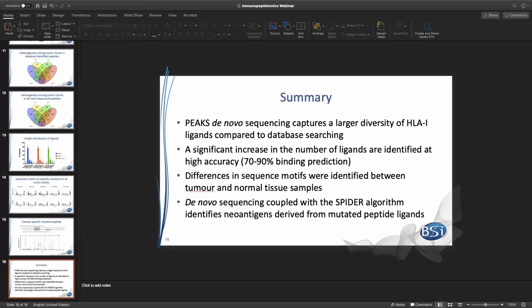And missing values are one of the major known issues for DDA, right? That's why even our lab is using DIA a lot. We're basically not using DDA as much as before. But I think that is really an issue with DDA. Yeah.